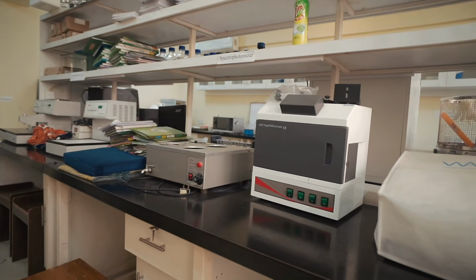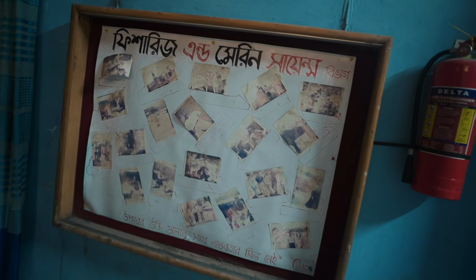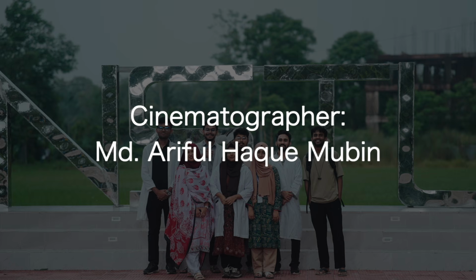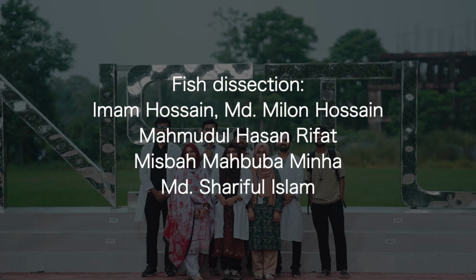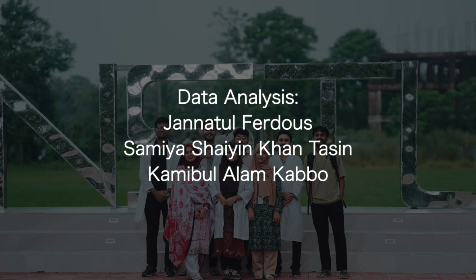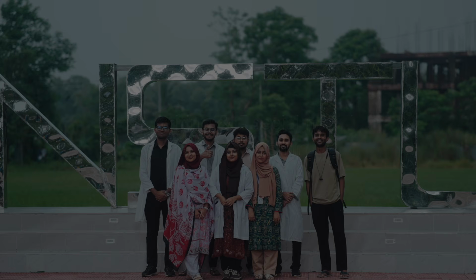Thank you for being with Team Chitra throughout this video. We hope this demonstration has helped you understand how the Gonadosomatic Index and Hepatosomatic Index are determined and their significance in evaluating the reproductive status and physiological condition of fish.